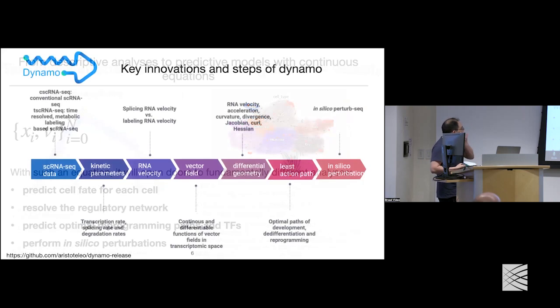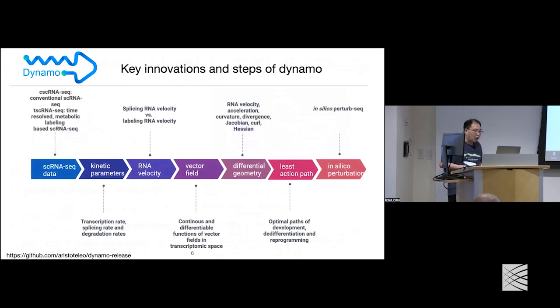So in order to achieve this overarching goal, we tried to search for and implement an innovative technology to improve the RNA velocity measurements. We also developed this predictive framework, Dynamo, to make mechanistic and predictive insights of cell-fate conditions.